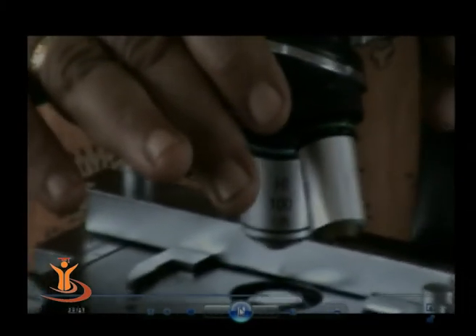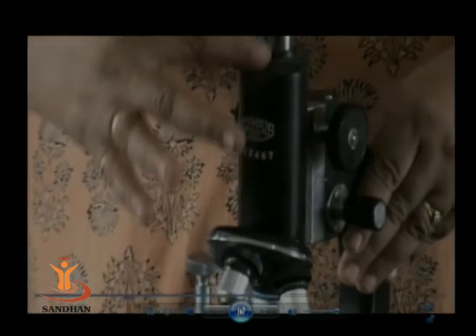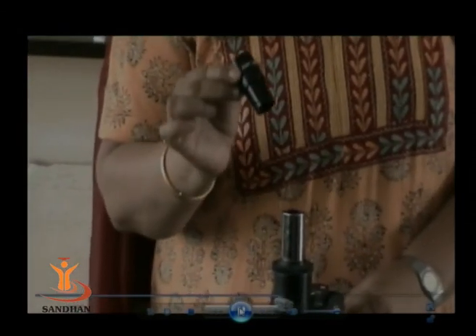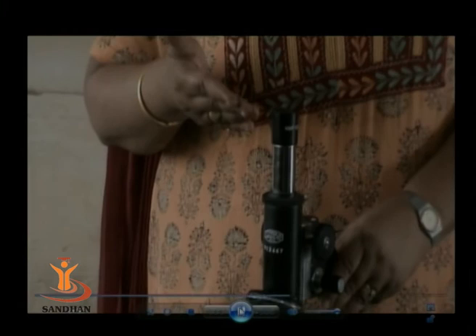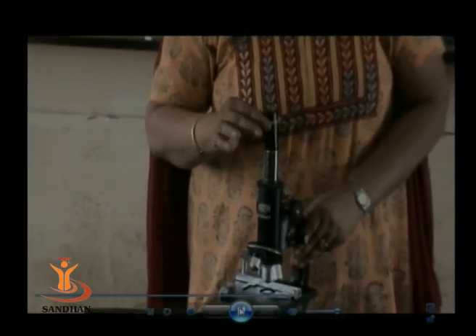After passing through the objective lens, the light rays pass through the body tube. This portion is the body tube of the microscope, and then they enter the eyepiece lens or the ocular lens. This is the eyepiece, and it is fitted with a lens, as you can see. This is the ocular lens, and it is called so because it remains near the eye while looking under the microscope, and that is why it is called the eyepiece lens.